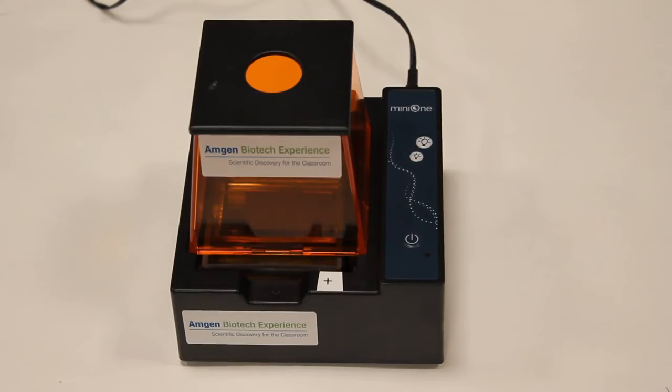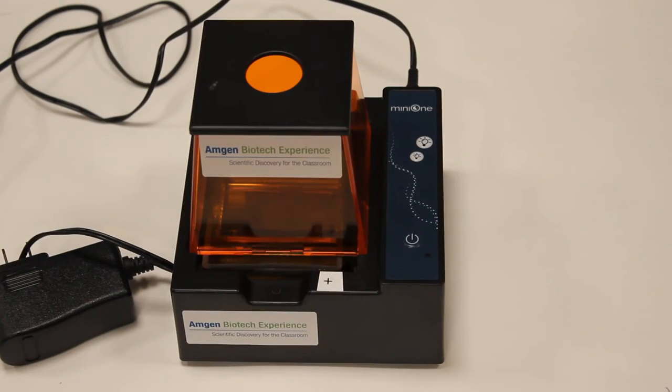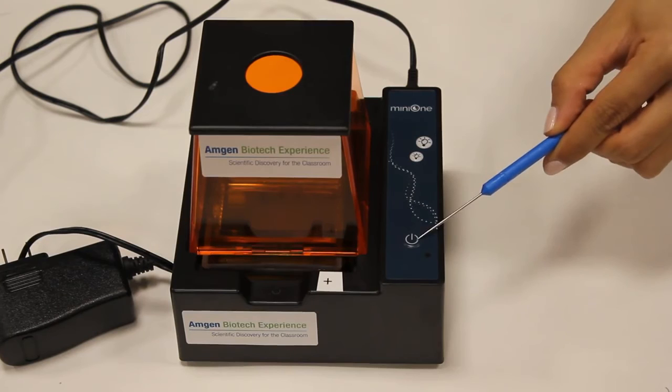After plugging the gel box in, use the power button to turn the gel box on and off.